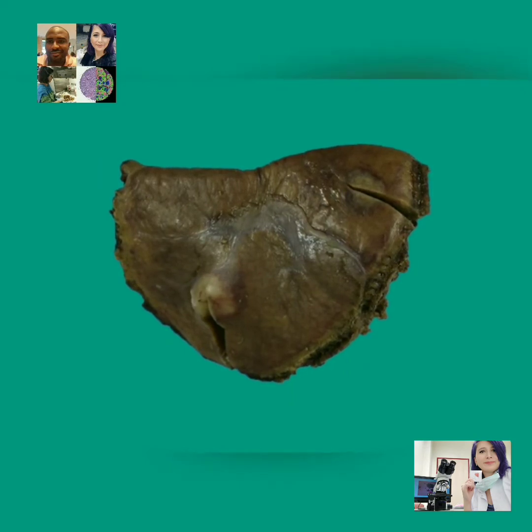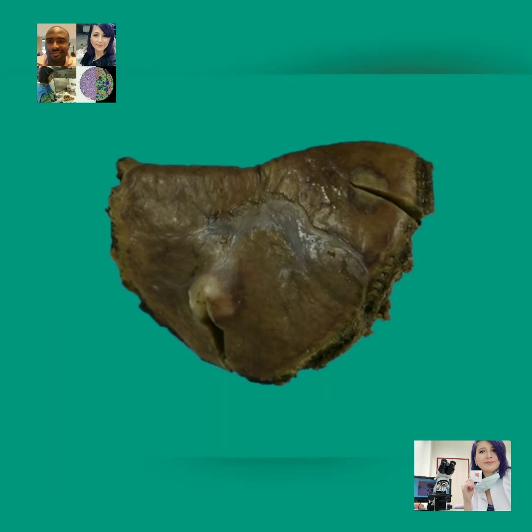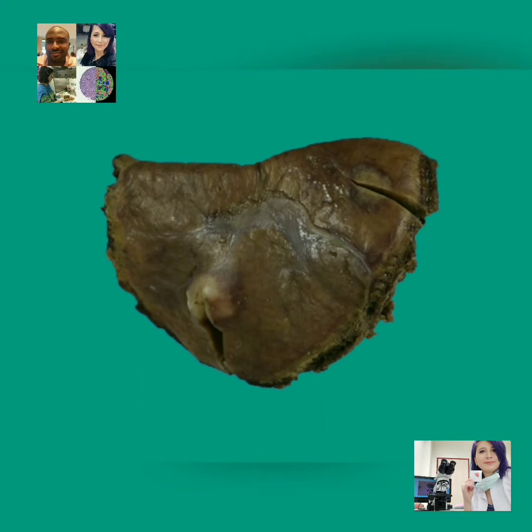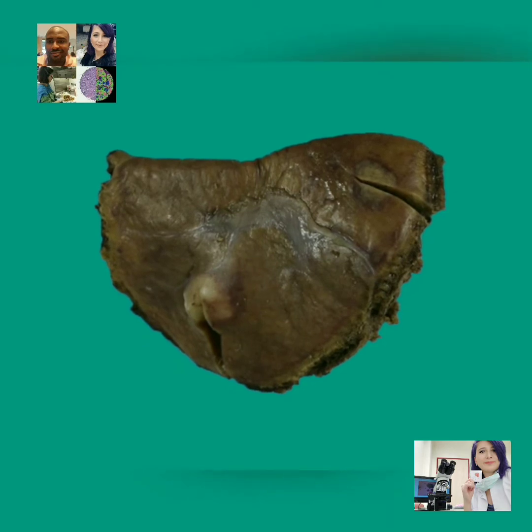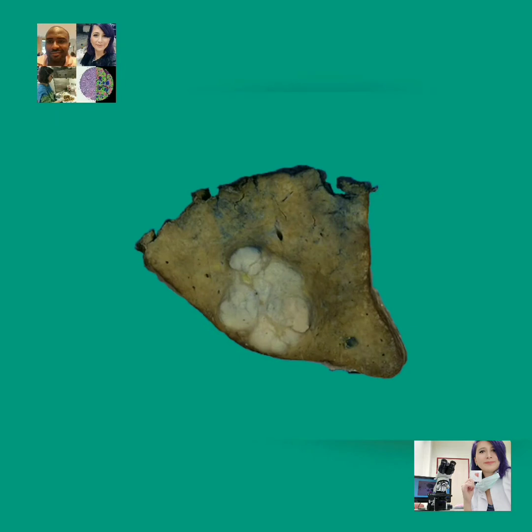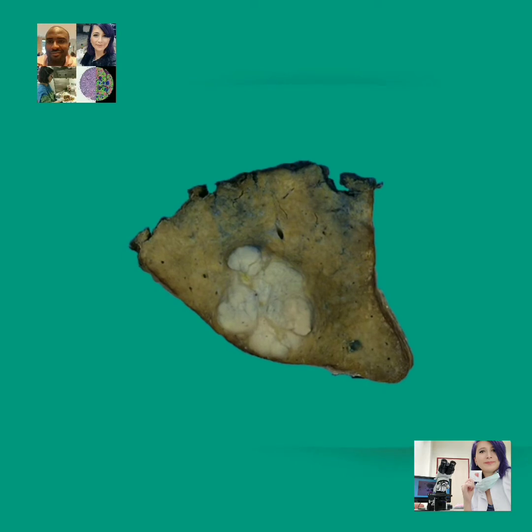Orientation markers provided by the surgeon may include sutures, ligatures, or incisions. It is necessary to photograph the specimen, then go ahead to identify the nature and type of sample based on the procedure carried out by the surgeon. For example, it could be a segmental resection with all the segments recorded, a wedge resection, partial hepatectomy, or a total hepatectomy.